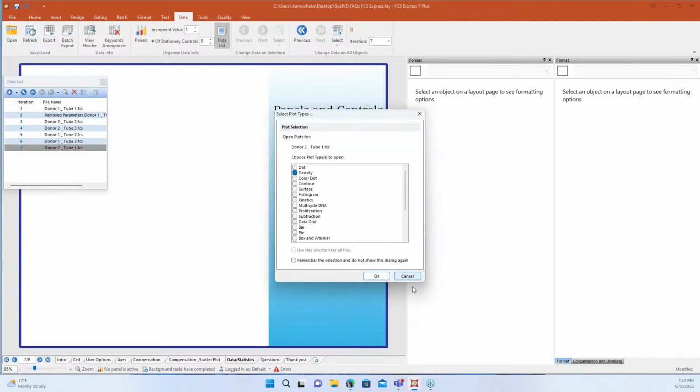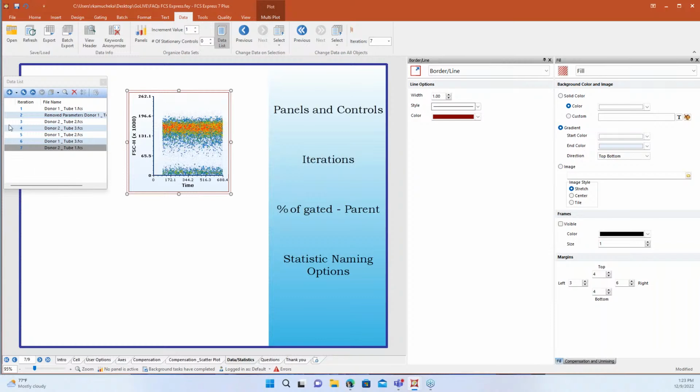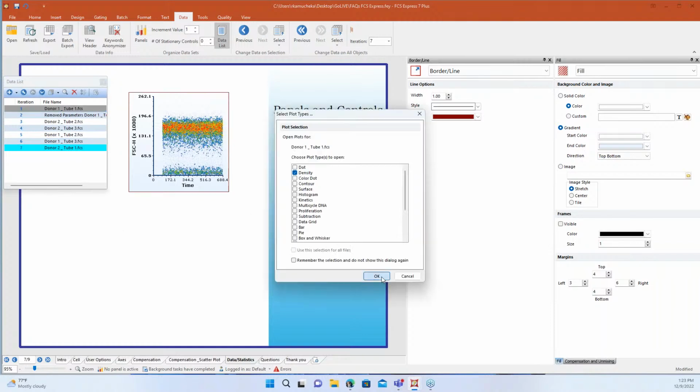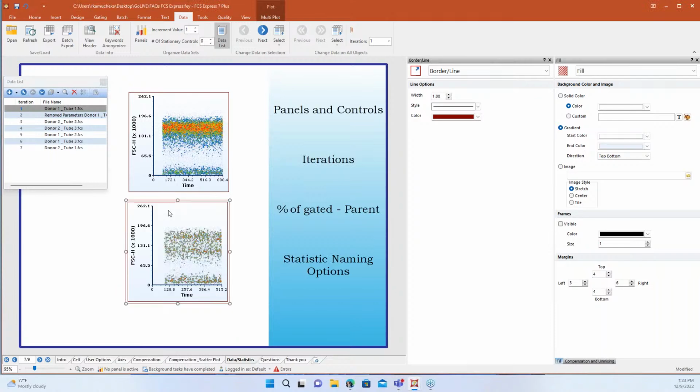So I'm going to drag out this sample and just create a density plot. It looks like it might have changed everything, or it's very happy with me today. I'm not really sure. Usually it's not so friendly. But what can happen here, maybe if I drag out this other tube here, and there we go. I just needed to move one more step here.